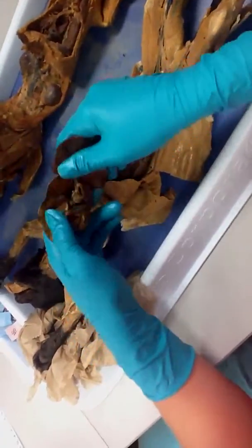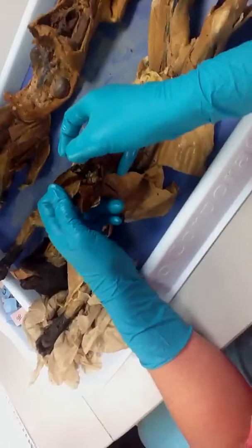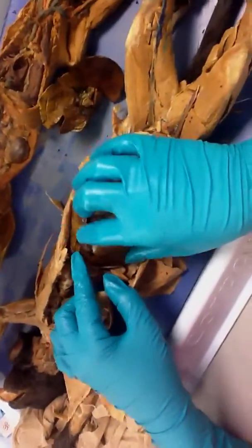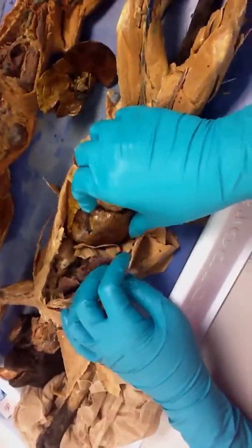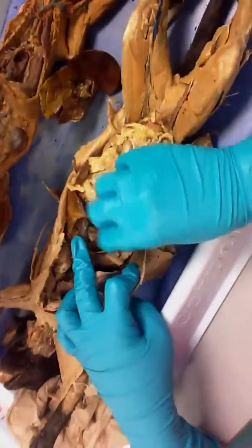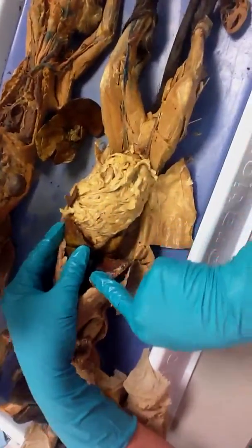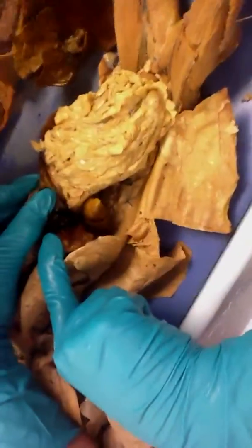And then in between here is the gallbladder. And this one, you can see the gallbladder sticking up through. Can you guys see it there? Can you see the gallbladder a little bit better?